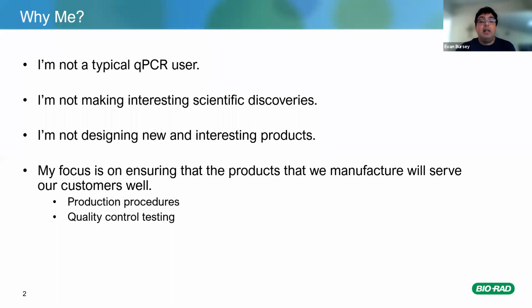My team spends a lot of time thinking about quality control testing. And I guess when I think about that, I'm not a typical qPCR user, but I do use qPCR in quality control testing, either for the purpose, say, of testing a new batch of a qPCR product, or sometimes we use qPCR for quality control testing of our other products. So I thought there might be some interest today in me speaking a little bit about how we go about designing our quality control test procedures.